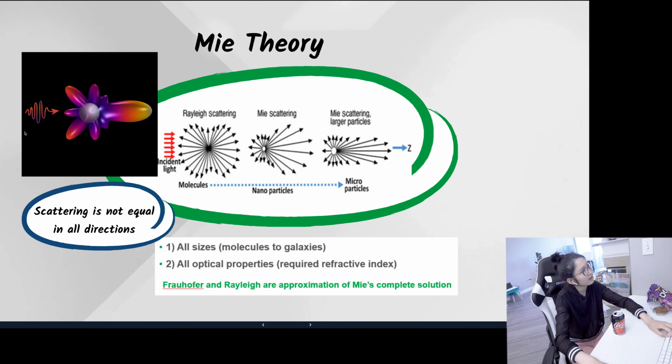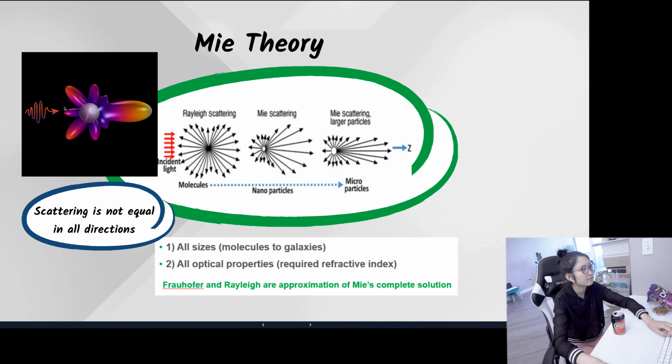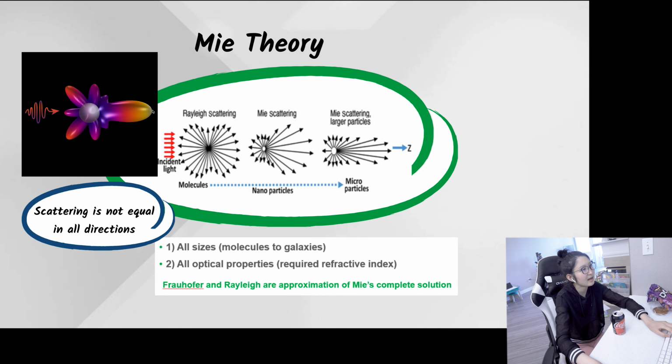And the really amazing thing about Mie theory is that the instant light hits the particle and interacts with the particle, the scattered light getting out of this particle is angular dependent. And this angular dependence is the key here. It's what we use in a type of technologies to measure particle size. So the light doesn't want to get out this direction, it really prefers to get out just in those directions. Like, how amazing is that?